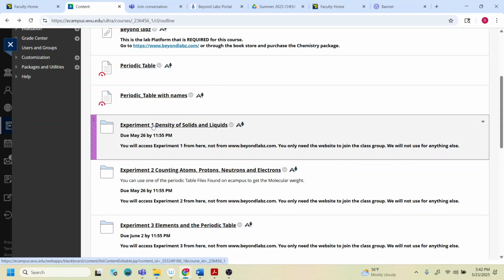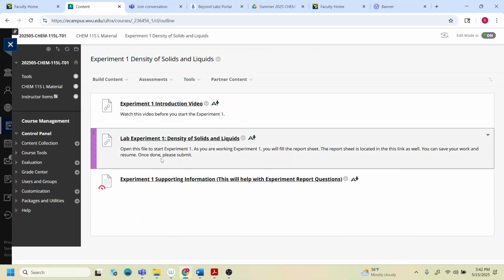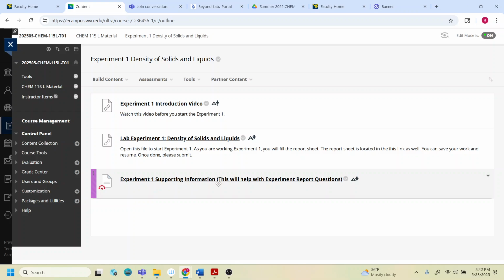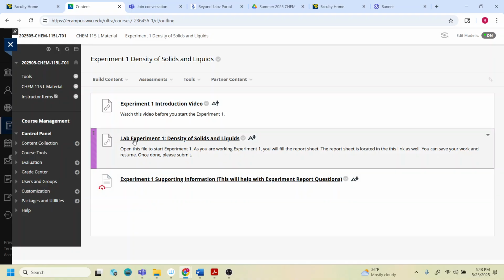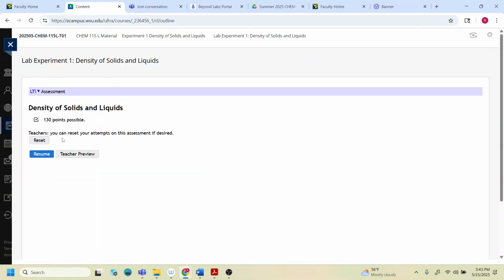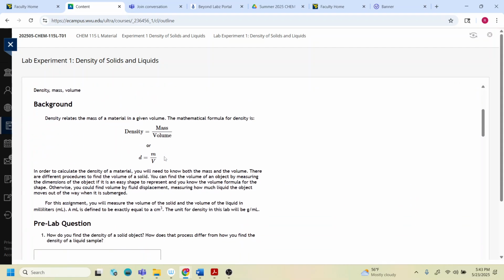For example, you're going to go to experiment one, and in experiment one you're going to see an introduction video. Please watch it, and you're going to see some supporting information. This information is for when you have a question-answer type of question or a calculation question; you might find an example of the calculation here, or an example of how to answer. So please look into that folder as well. Your actual experiment is here, and this is everything that you need. You're going to access your experiment from here.